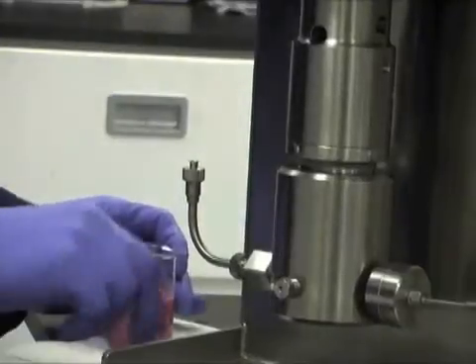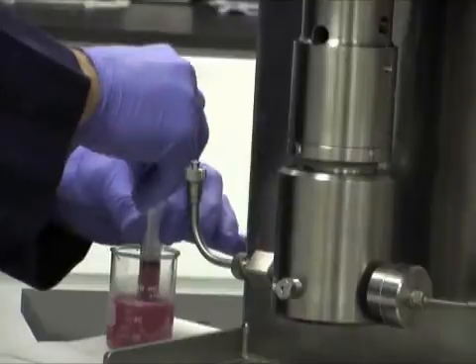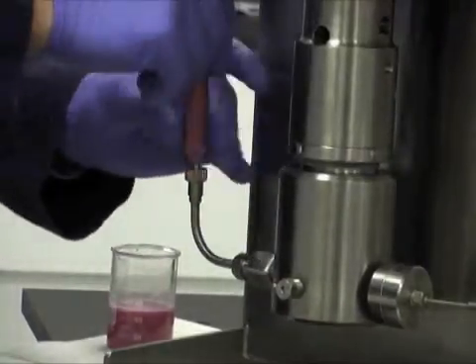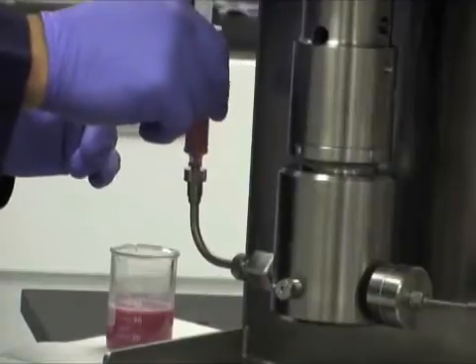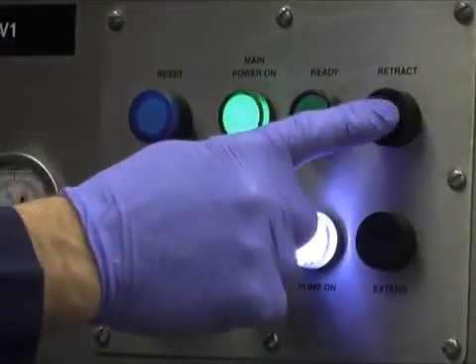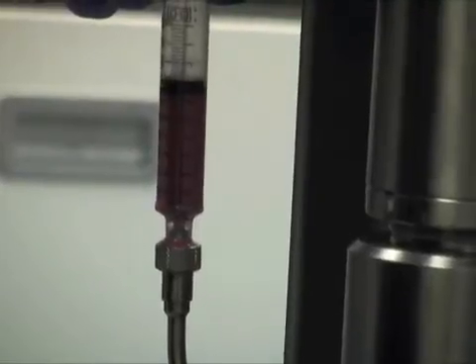Next, simply draw your sample into the provided luer lock syringe and attach it to the inlet connection. Here we are creating an oil and water emulsion, colored red and blue, to visually demonstrate processing effects. Press and hold the retract button to pull in as much of the product as desired, then release.